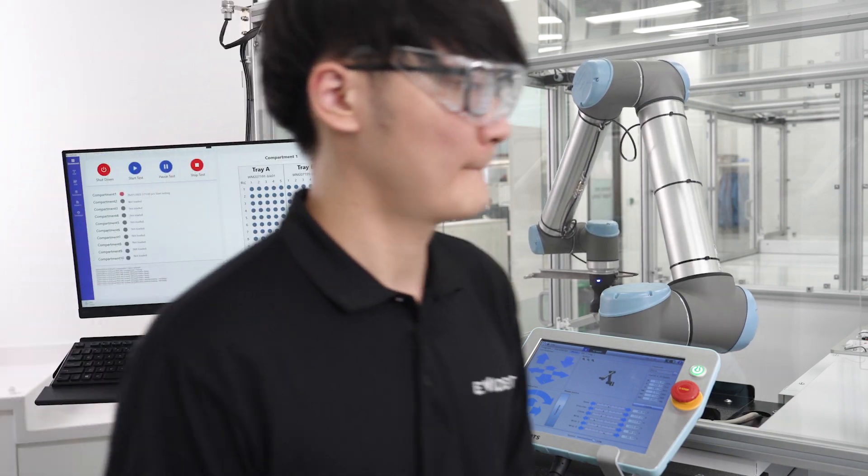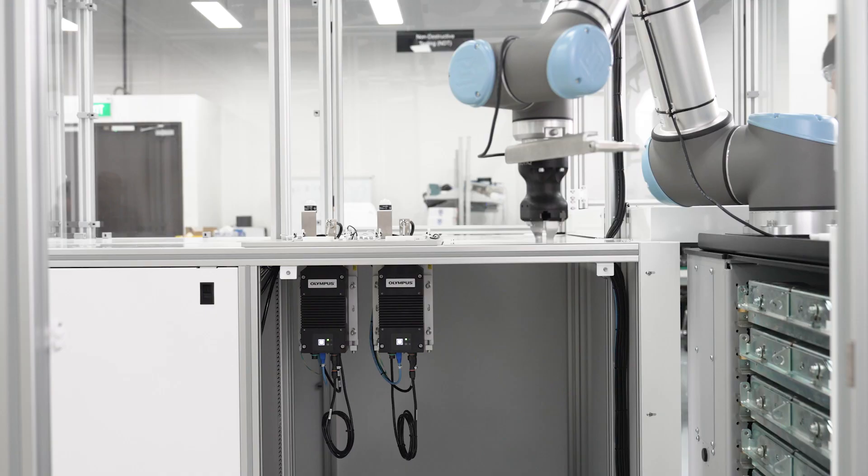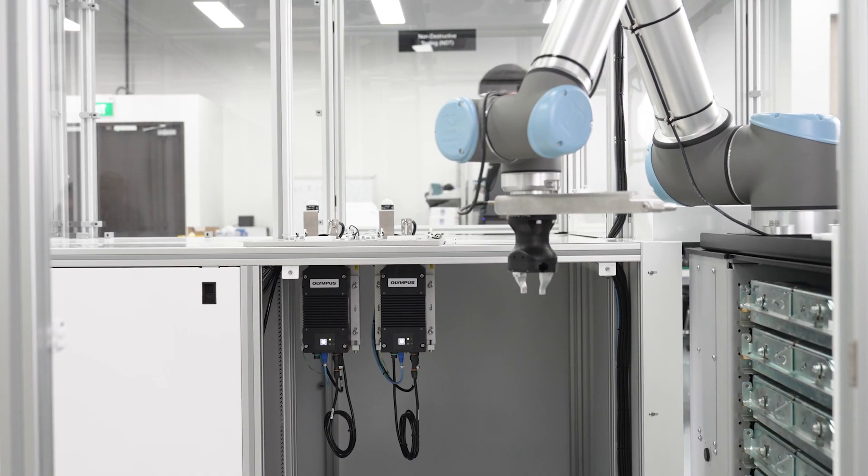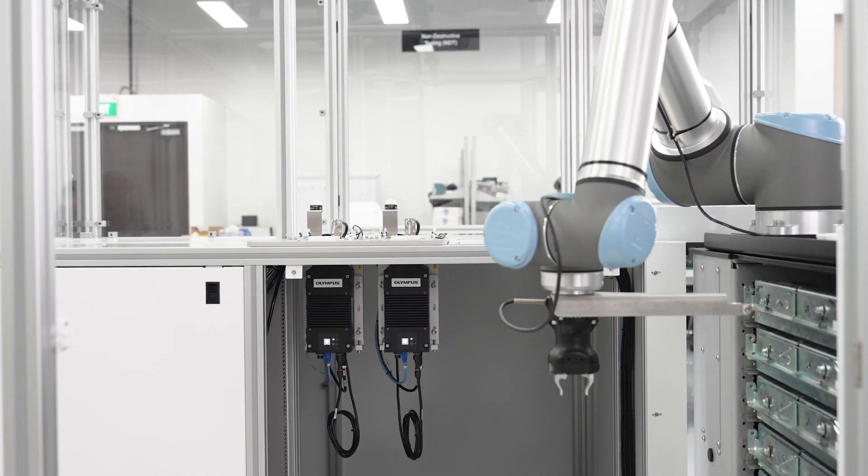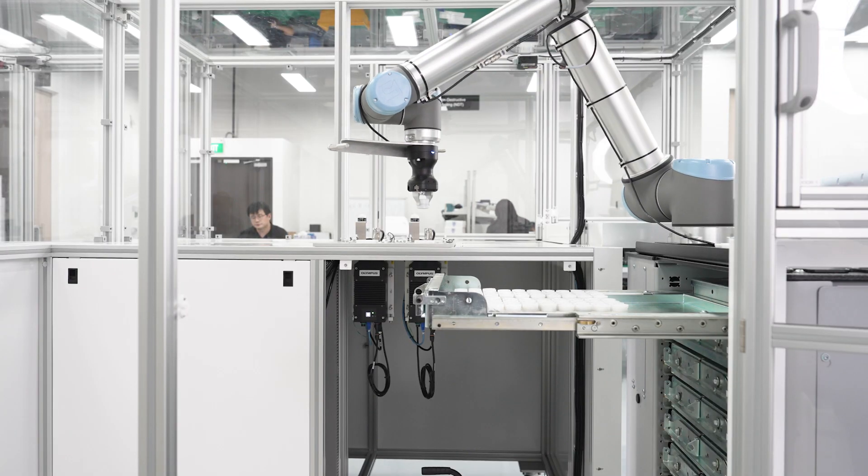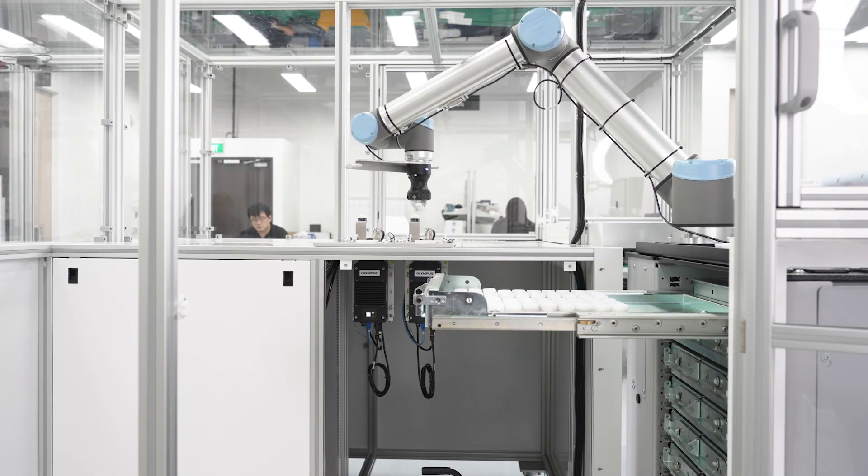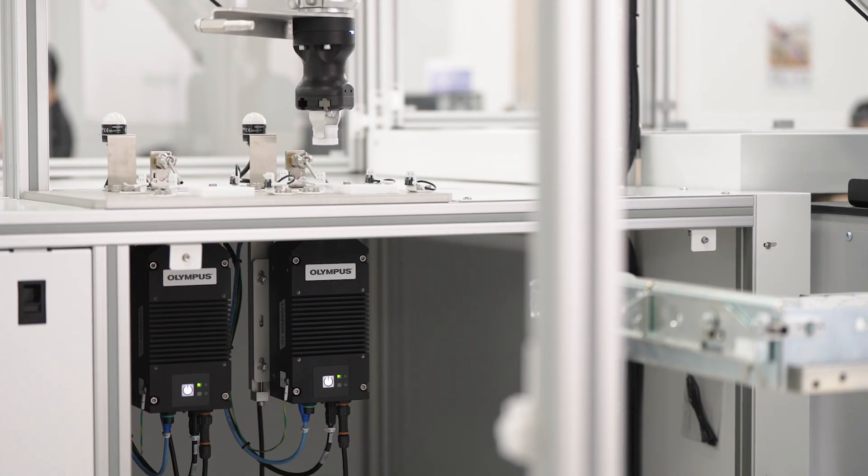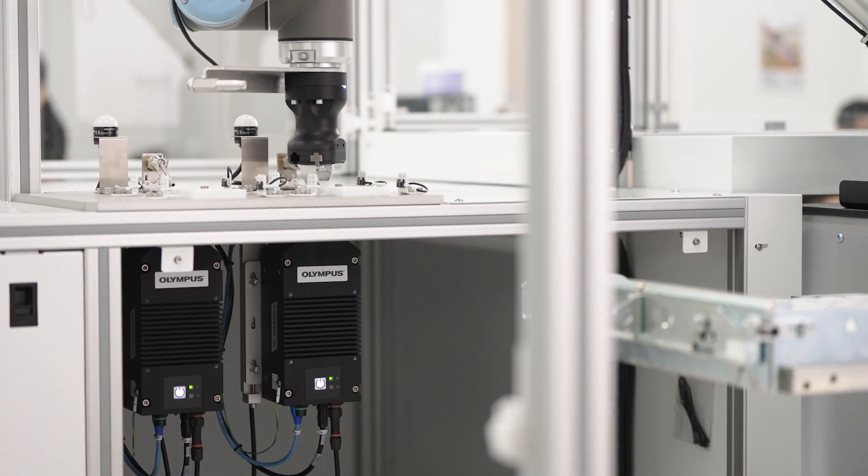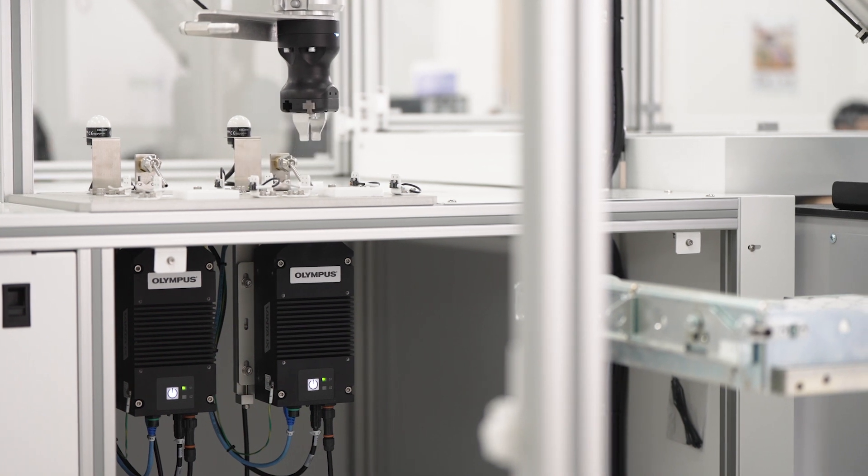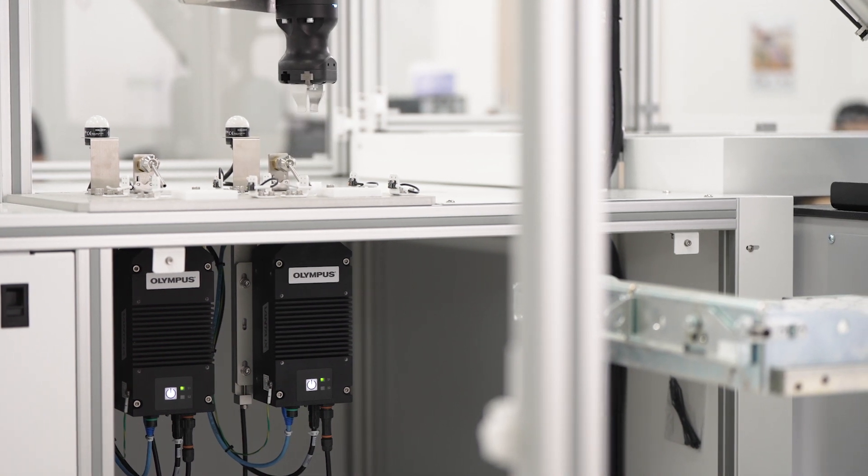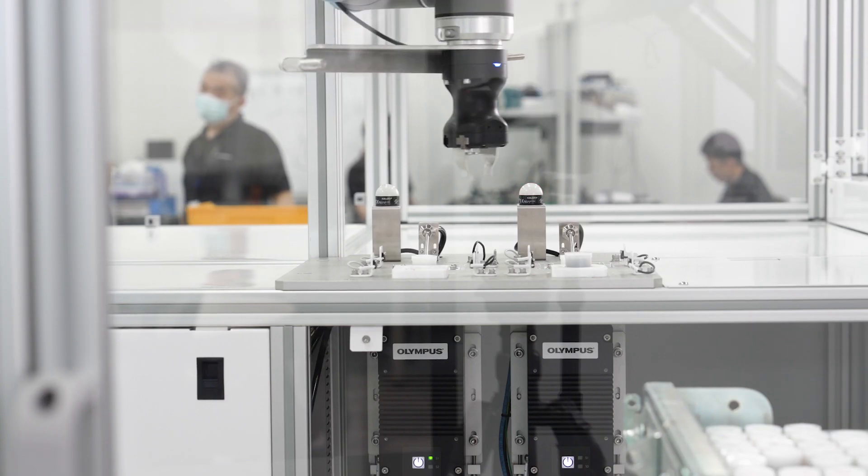Powering the system is our Vanta IX inline XRF analyzer. A rugged and high-performance industrial module that automates material analysis on the production line.